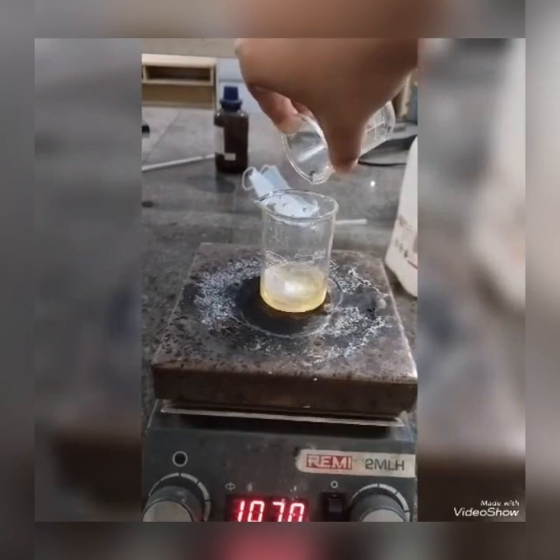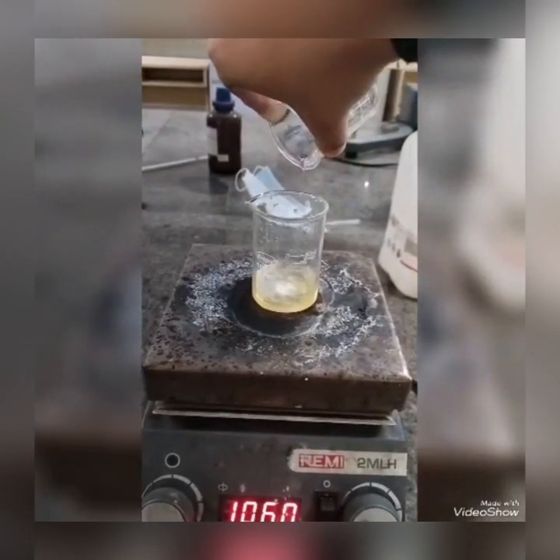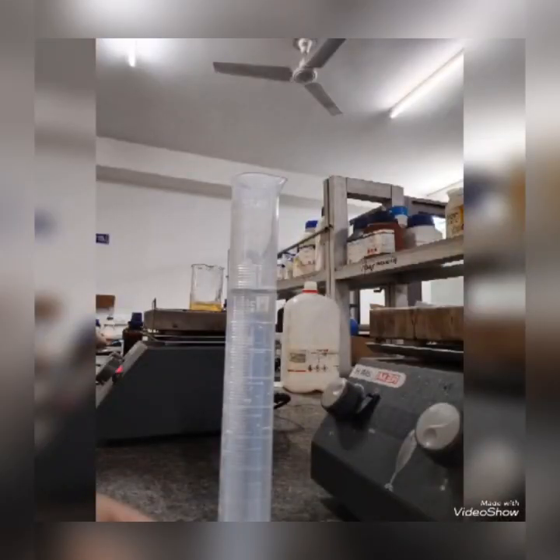After that, the oil-in-water microemulsion was homogenized at 10,000 rpm for 15 minutes.